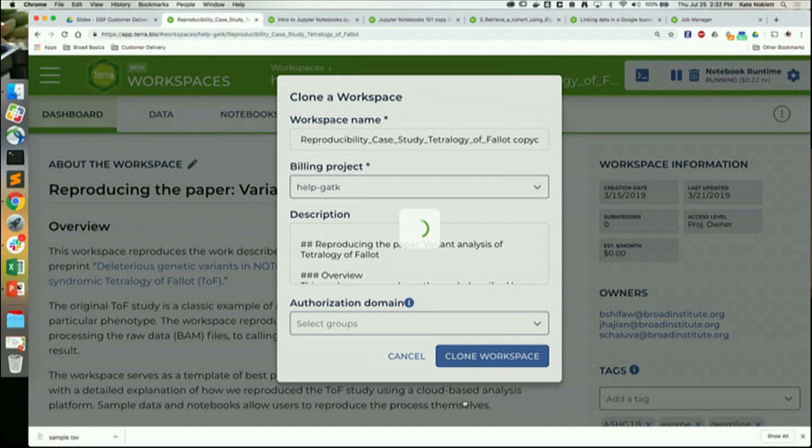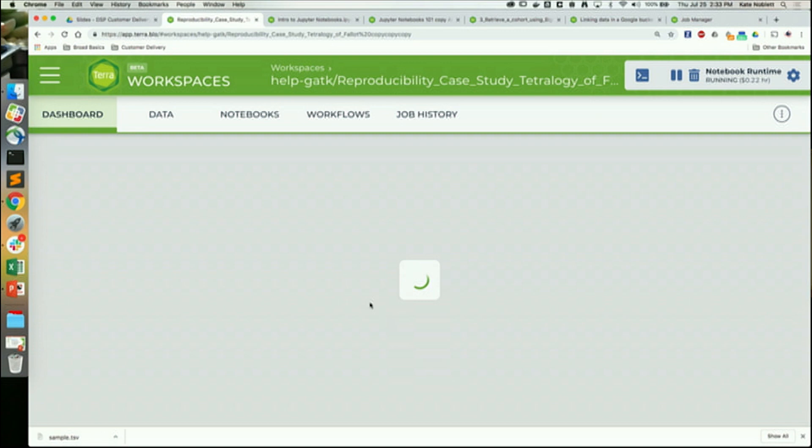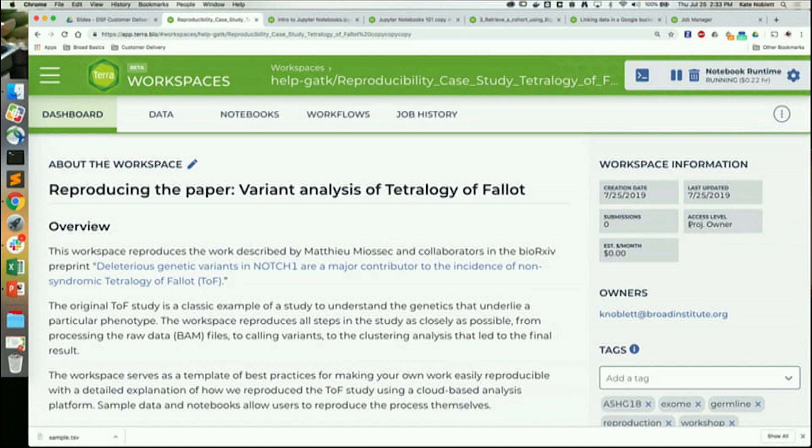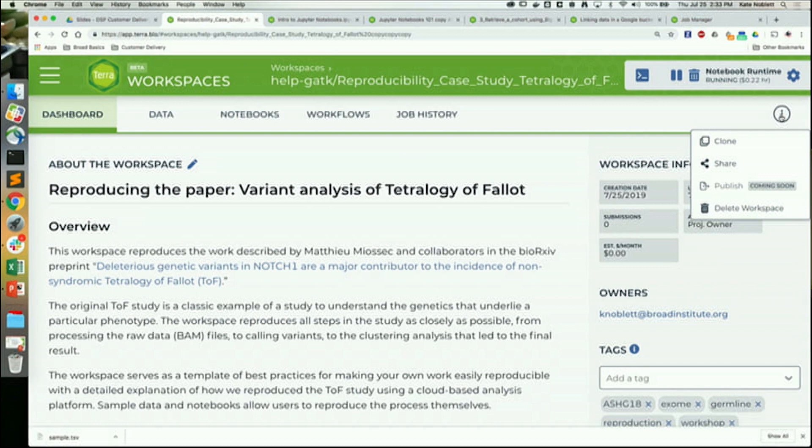I like to point out the usefulness of this feature — you can just make as many copies as you want. It's a very nice part of the platform. Here I am now in my own copy, and if you've done that, you should have an access level of project owner.